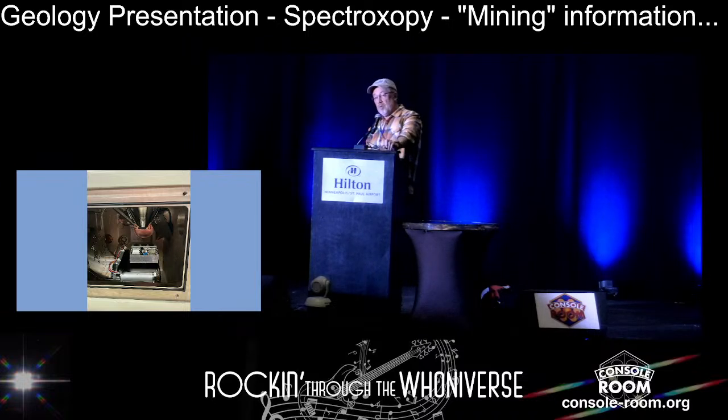I have ruined the backscatter detector, which sits right at the base of what we call the pole piece. We've had students do that, and it's a $6,700 mistake the last time it happened. In fact, I was sitting at the computer with a student who I thought was interpreting the image the same way I was, because we were watching as we raised the stage. It has to be about 10 millimeters, a centimeter away, and they ran the sample right into it while I was sitting there. But we're fortunate we have a reasonable budget here. We were able to replace that pretty quickly, and within a few days, they had one in stock, thankfully.